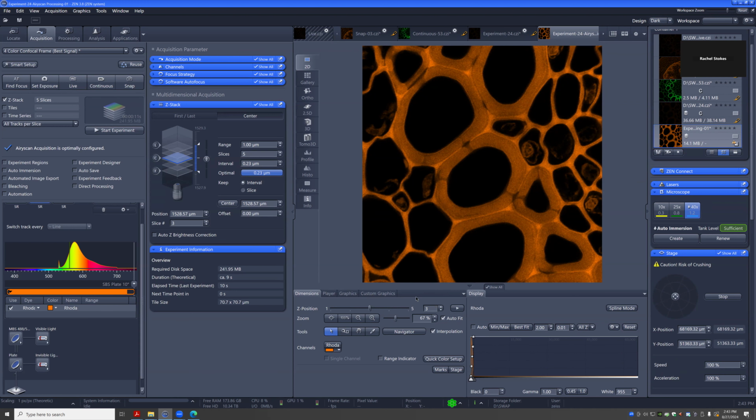So really here you don't see that tab anymore. So this is how I know, oh, this is my stack, right? This is my stack that's processed. This is something you can open in Fiji or whatever other software.